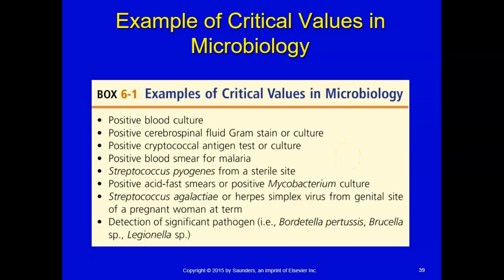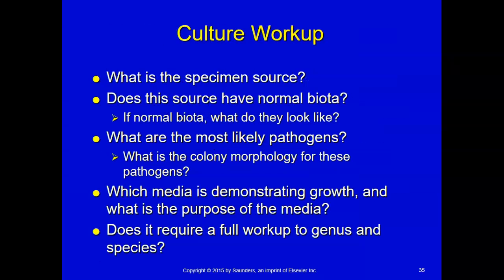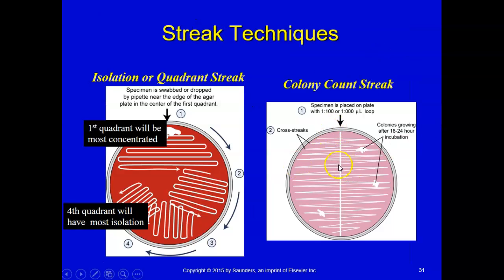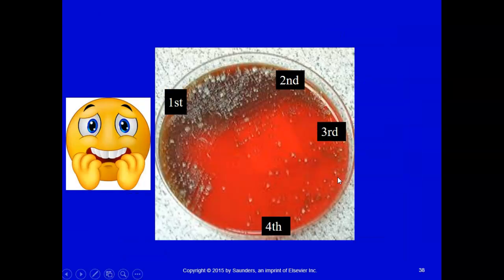So very, very important. I want to go back and make sure that you know that the first quadrant is the one where we expect the most concentration of bacteria, and the fourth quadrant is the one where we expect the most isolated colonies. Very important. And what techniques do we use to isolate bacteria? The isolation or quadrant streak is used to isolate bacteria, and the quantitation streak is used to quantitate or do a colony count. All right. Well, I enjoyed this chapter, and I hope you did too, and I am ready to really get into it. I love microbiology. That is the end of Chapter 6, Part 2.